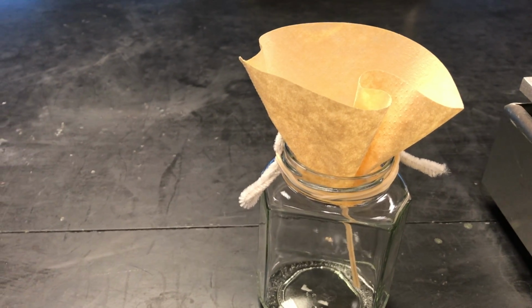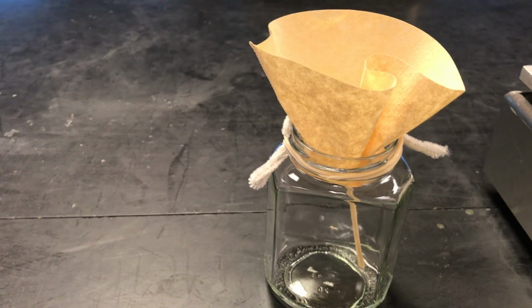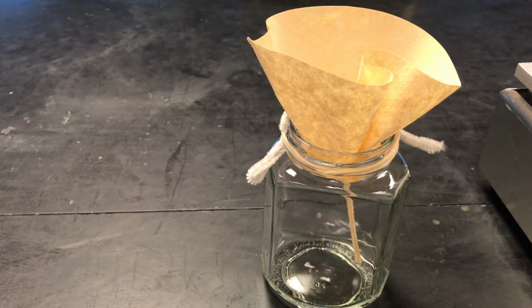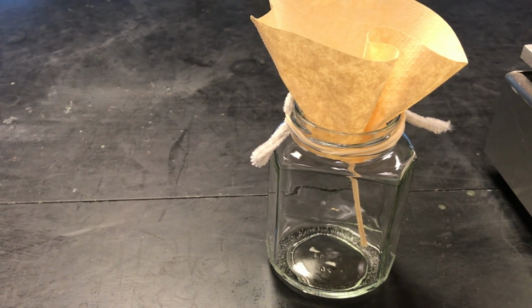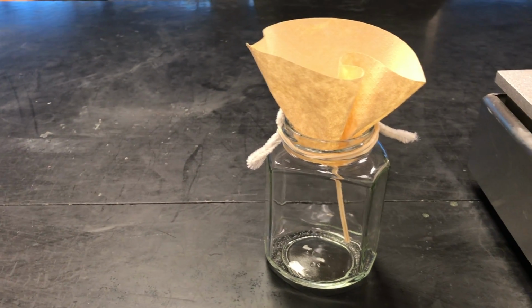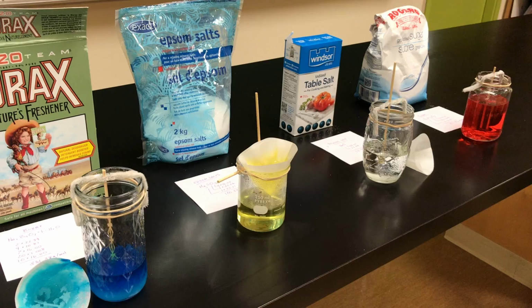The reason that we're bothering to strain this is we want to avoid any nucleation point other than the stick that I'm going to have in the jar. We want the crystals to grow on the stick as our nucleation point, not at the sludge at the bottom of the jar. And so that's why we're filtering that. I'm going to do this in the lab with the sugar solution and the borax, and I'll come back and show you the grown crystals.